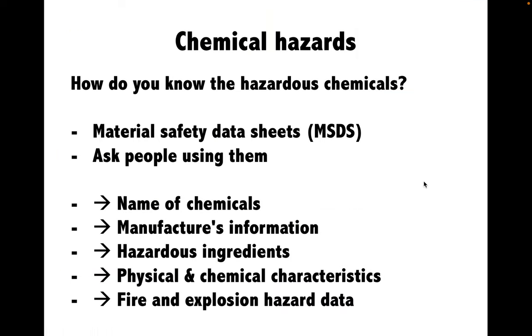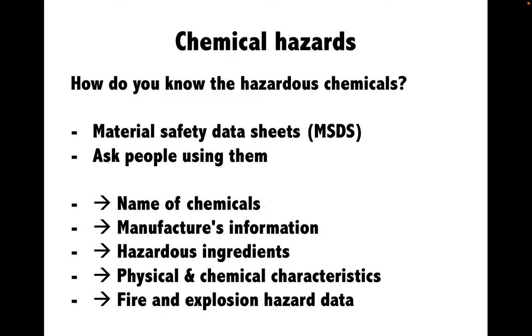All reagents used in the laboratory are chemical compounds and you need to be aware of their potential risks and hazards. You can find the full details of each chemical agent in the document called Material Safety Data Sheets, or MSDS, or you can learn from your laboratory co-workers. The MSDS provides all information about the chemicals and is available online as international legislation. The information includes the name of the chemicals, the manufacturer's information, the hazardous ingredients, and the physical and chemical characteristics.